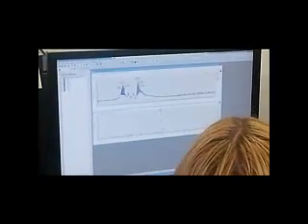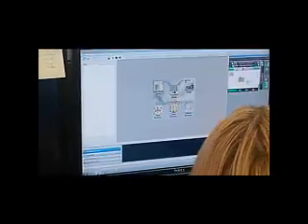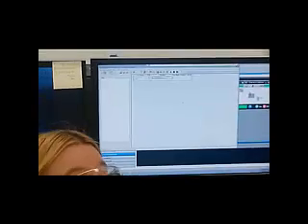Okay, now we're going to do the setup for what you're going to be doing today. The first thing you do is go over to Excalibur, which is this program right here, the X down at the bottom. I've already loaded the sequence setup for you. You're going to click sequence setup, and it's going to be loaded here. The only thing you're going to change is, instead of Mountain Dew Dr Pepper test, you're going to put your name. Single click into here and change the name. You're not going to do anything to the other one.